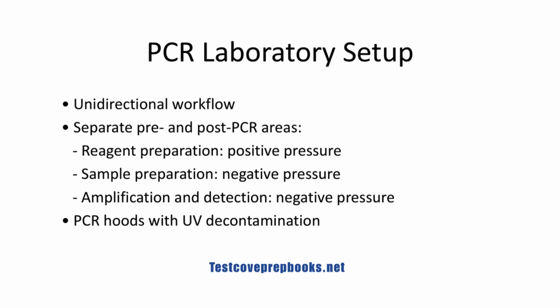To prevent contamination, the PCR laboratory setup is very important. A unidirectional workflow should be maintained, moving only from clean to contaminated areas. Pre- and post-PCR areas must be separated. Reagent preparation should be in a positive pressure environment. Sample preparation should occur in negative pressure. Amplification and detection should also take place under negative pressure. PCR hoods equipped with UV decontamination are used to reduce contamination risk.